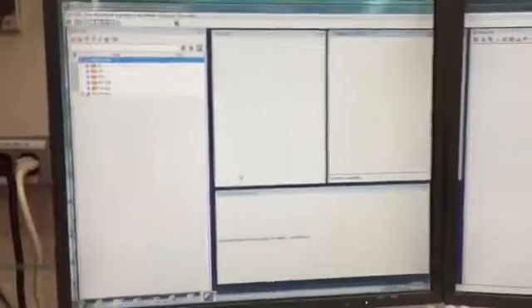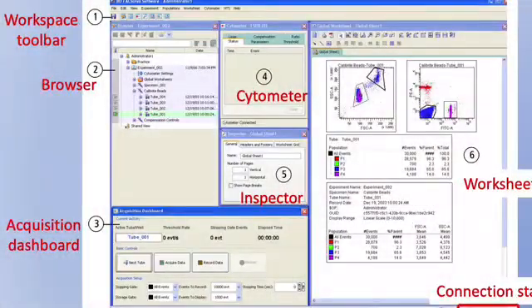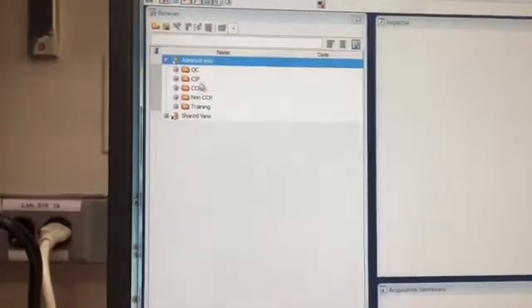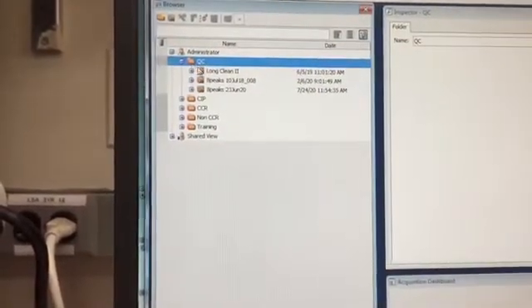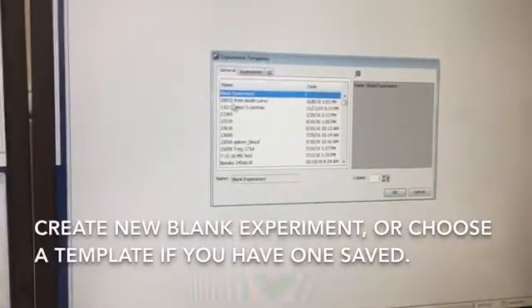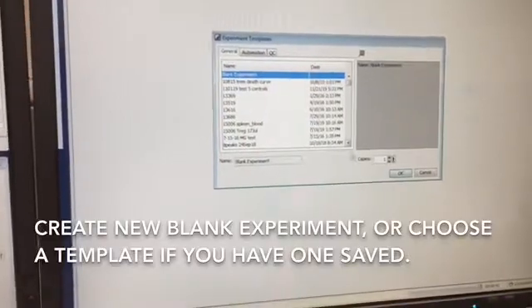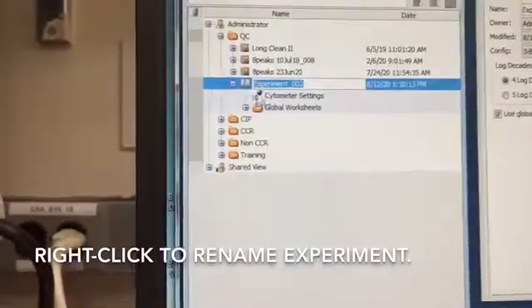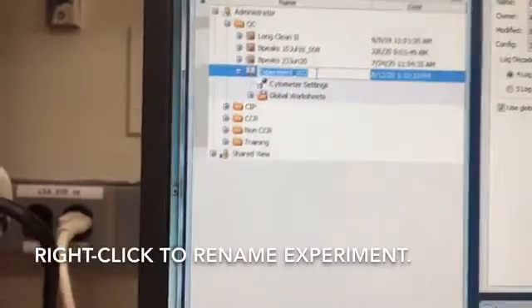You can see we've got two monitors — it's nice to be able to spread things out. You can use the right-hand monitor for your worksheet where you look at your plots and gates. On the left, you'll see a number of windows. The one on the far left is called the browser, and within the browser there are a number of folders. I'm going to make a new experiment here in the QC folder, so I double-click on that, then go to the Experiment menu and select New Experiment. You get some options; if you've got a template saved, this is where your template would appear. For now, I'm just going to start with the Blank Experiment. The blank experiment appears in the browser with a default name. If you right-click on it, you can rename the experiment — I recommend something descriptive like your initials, date, and study.